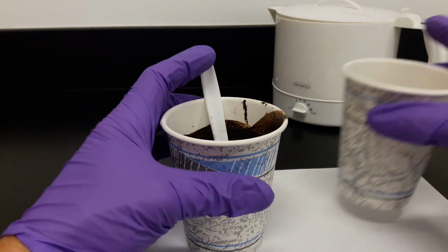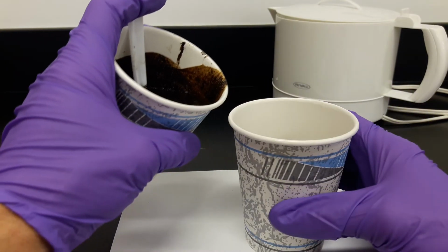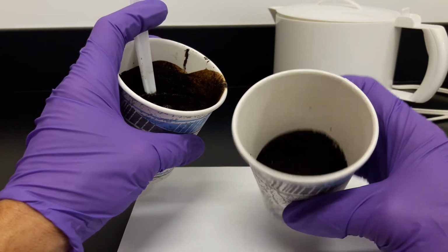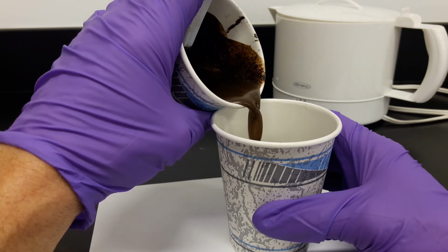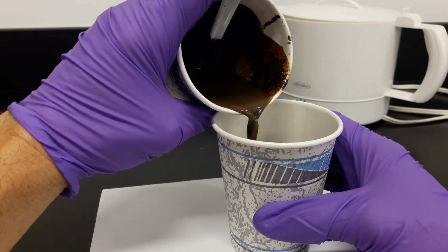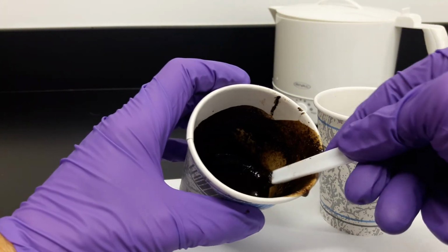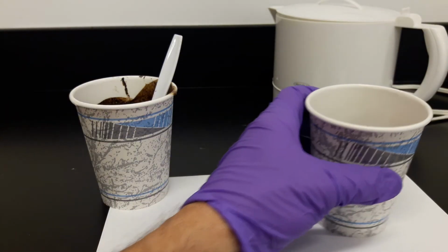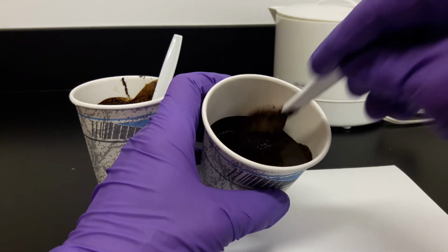Okay, so the solution has approximately had 1 or so minutes to rest, and now I'm going to pour as much of the hot water and oil into the cup containing the cleaned oil. Okay, so now notice in this cup I've got a lot of sand, and in this cup I have hardly any sand, still some, but it's a lot cleaner.